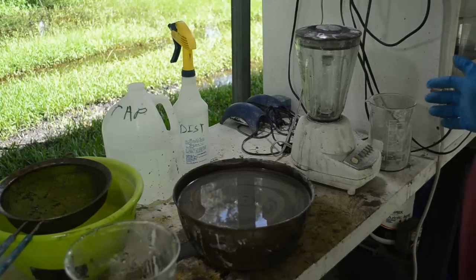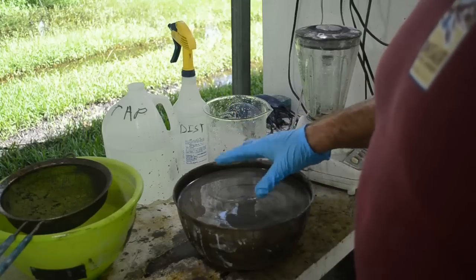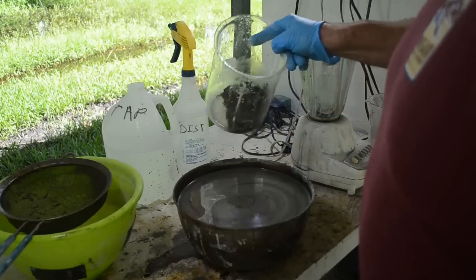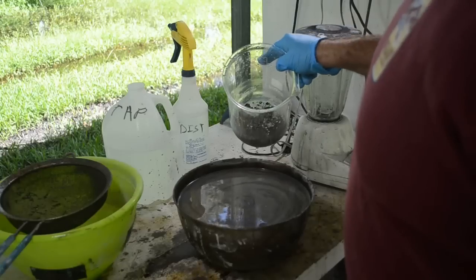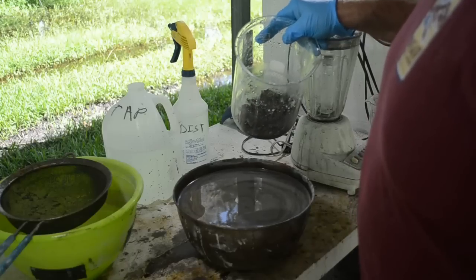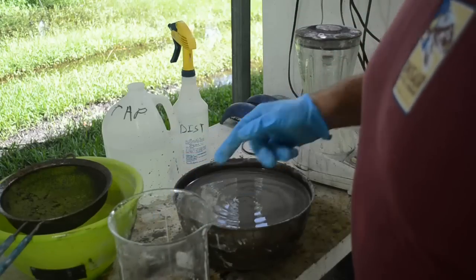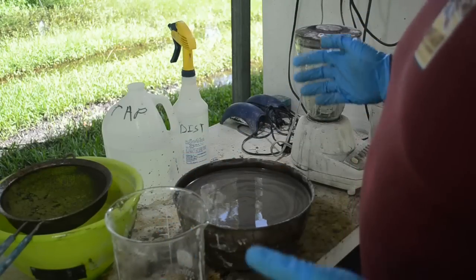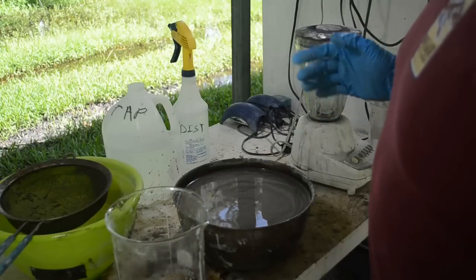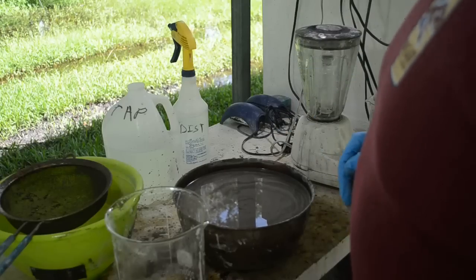That took a little while and made a heck of a mess on the bench, but it's done. I've got all the fine material that would go through the screen in one container and I'll dump off the water to show you. The heavier stuff that would not go through the screen even after several trips through the blender wound up in this beaker — looks like mostly copper. I've got a magnet here — there's not a lot of steel in it, which is nice compared to random IC chips. Looks like mostly copper; I'm hoping there's a lot of silver in there too.